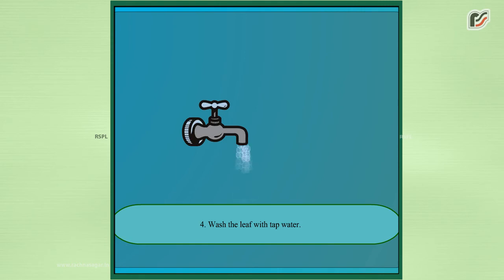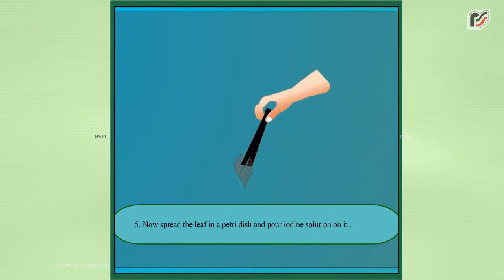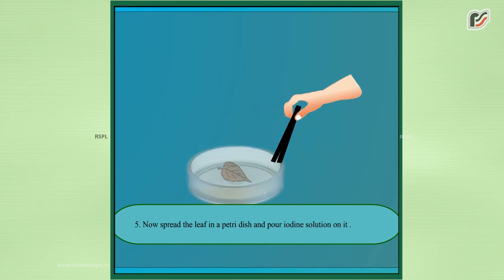Wash the leaf with tap water. Now, spread the leaf in a petri dish and pour iodine solution on it.